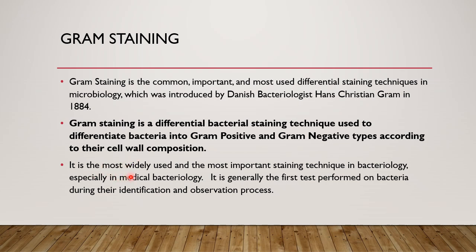It is the most widely used and most important staining technique in bacteriology, especially in medical bacteriology. It is generally the first test performed on bacteria during their identification and observation process. This is one of the basic, most important staining techniques. As soon as you get the bacteria and want to know about them, the first method you use is staining. You do staining and you observe it under the microscope. Hence this is one of the basic and most important staining techniques that I think all bacteriologists would know.